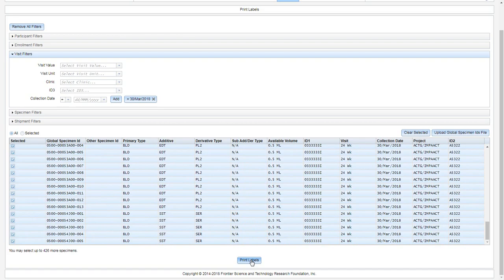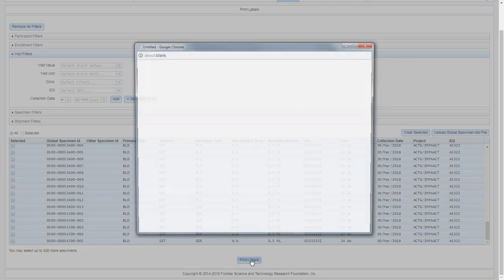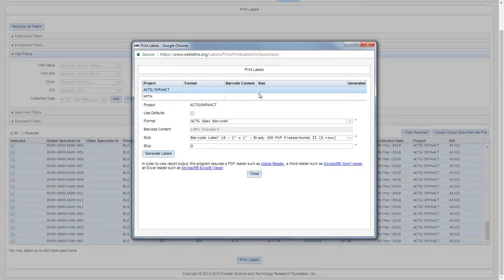And then you may click print labels in the bottom center to bring up the print label menu.